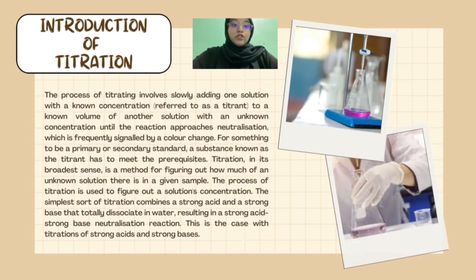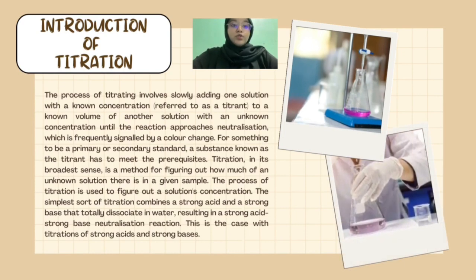About the introduction of titration. I will explain to you the definition of titration. The process of titrating involves slowly adding one solution with a known concentration, referred to as a titrant, to a known volume of another solution with an unknown concentration until the reaction approaches neutralization, which is frequently signaled by a color change.